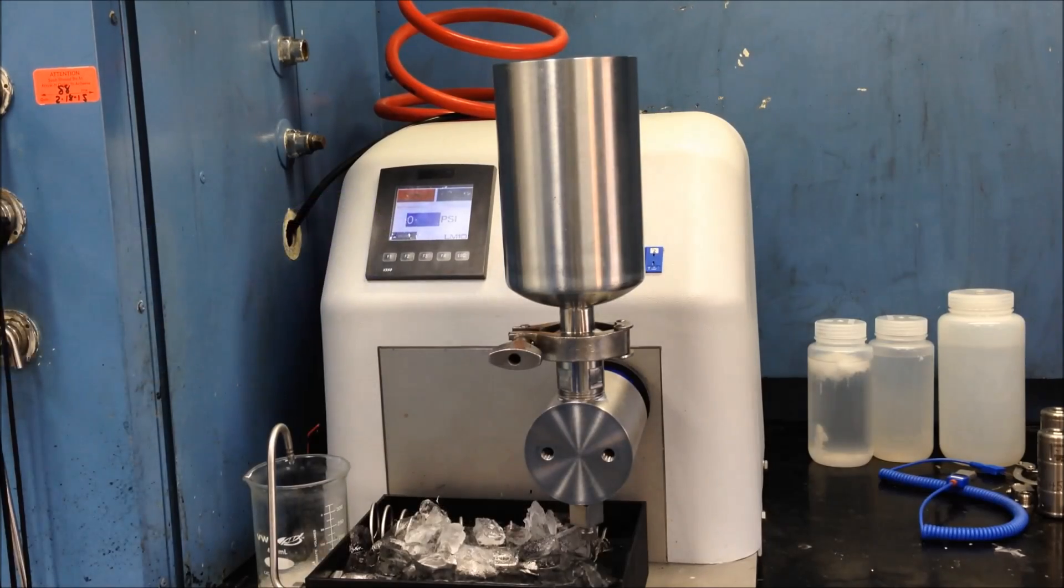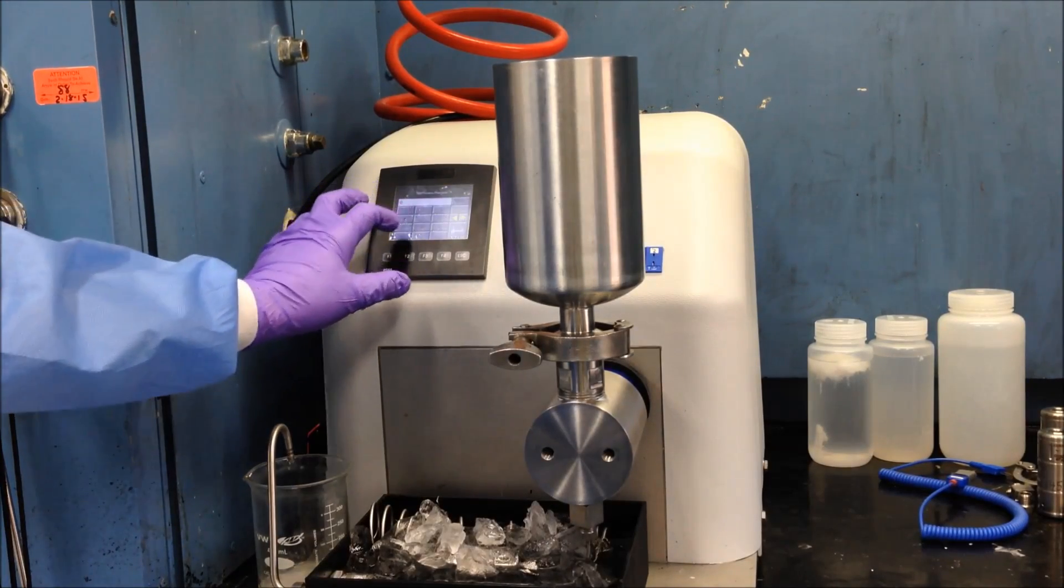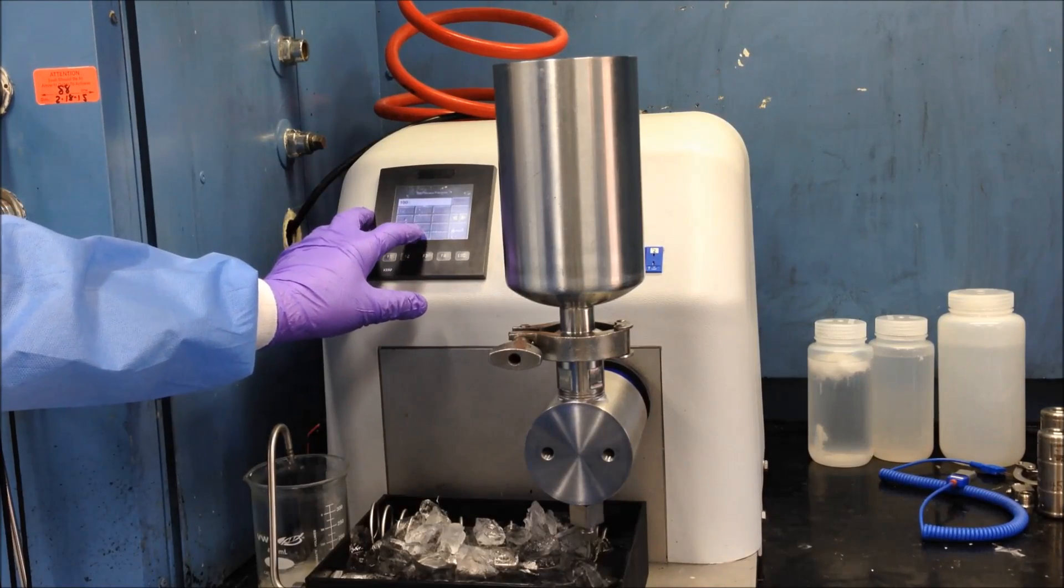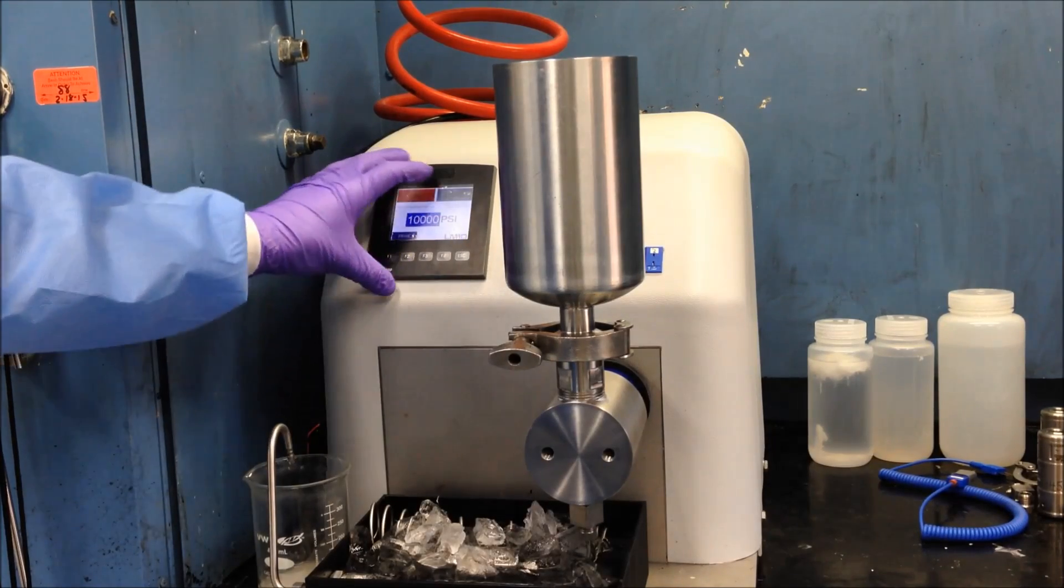After priming the machine, we can input our processing pressure. In this case, our processing pressure will be 10,000 PSI.